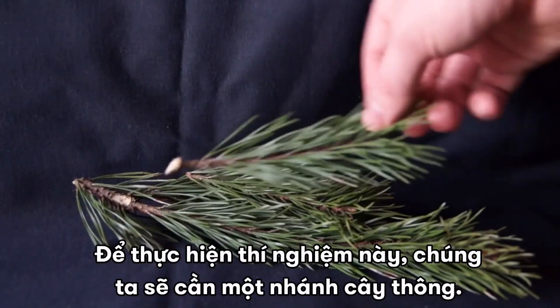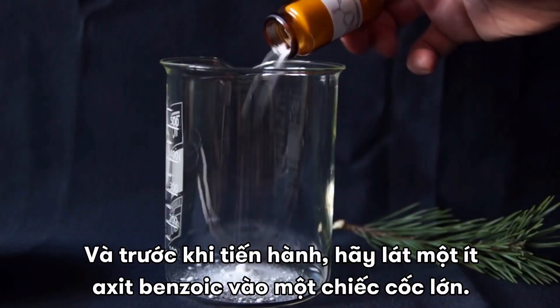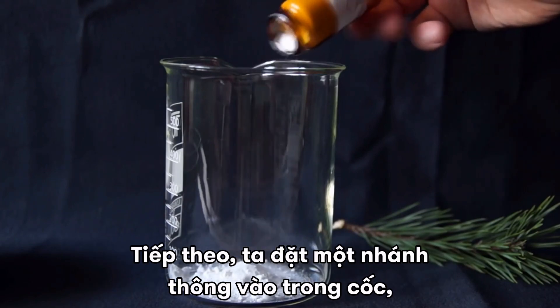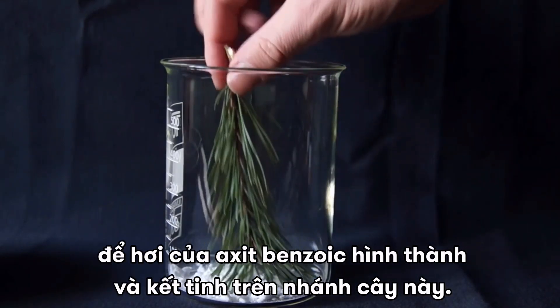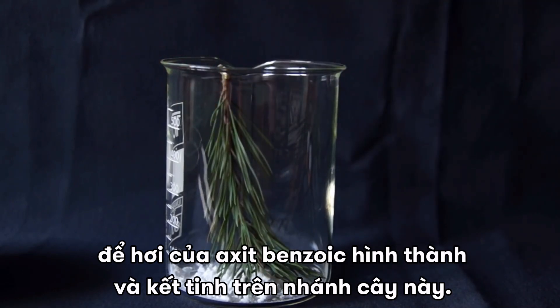For this experiment we will need a fir tree branch. To begin, let's pour a small amount of benzoic acid into a large glass. Next, place the fir branch in the glass, so that the fumes of benzoic acid, which are going to form, can settle on this branch.